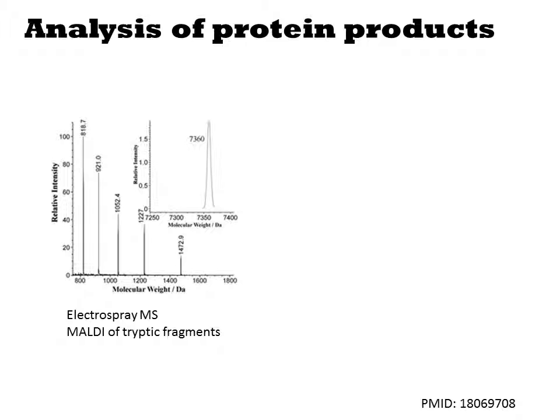You will ionize the protein and zip it through a magnet. In electrospray mass spec, you vaporize the sample, and as the solvent evaporates, ions get trapped in the particle, giving it charge. This allows detection by mass spec. You end up with several bands in the spectrum for each protein corresponding to particles with different charge. Software can back calculate the size of the protein from this data very precisely.